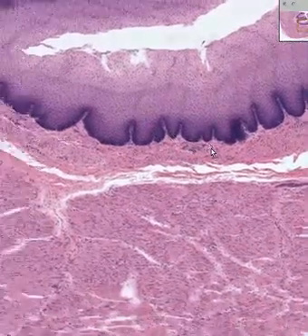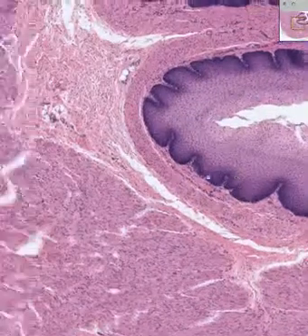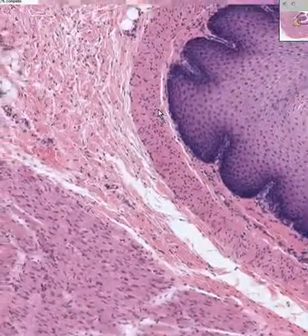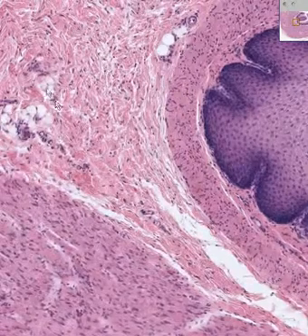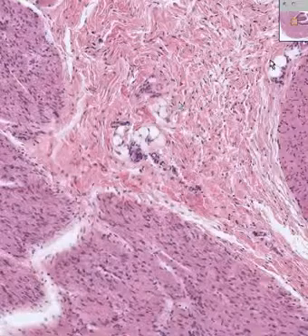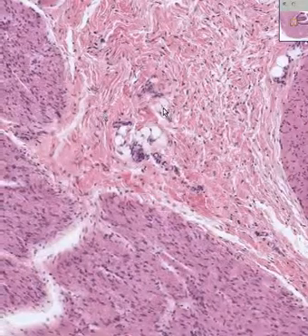Notice right underneath that, you have some smooth muscle. I think this could very appropriately be called muscularis mucosae. And the reason why you know it's muscularis mucosae is because it's above the submucosa. And here is the denser connective tissue of the submucosa, some fat, mostly spindly fibroblasts and collagen.